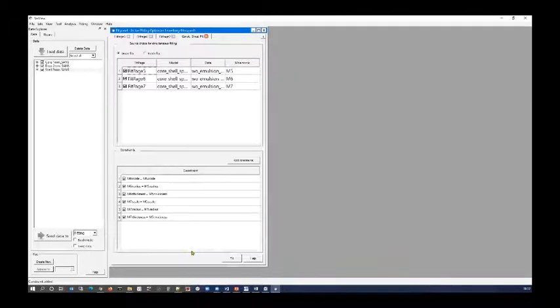I'm not going to tie the backgrounds together because I've got some samples that are in a deuterated medium and some that are in a hydrogenous medium. So the background levels are going to be different. I'm going to let those float. And then I'm going to click the fit button here in the simultaneous fit page, not on the individual fit pages.